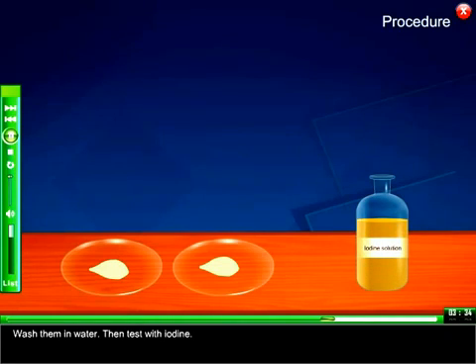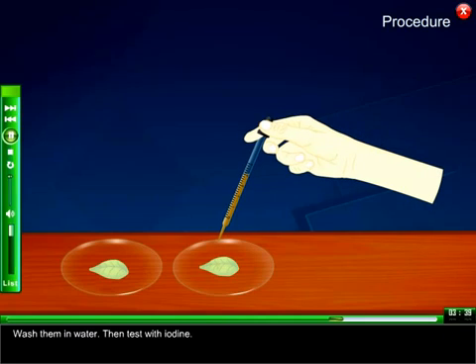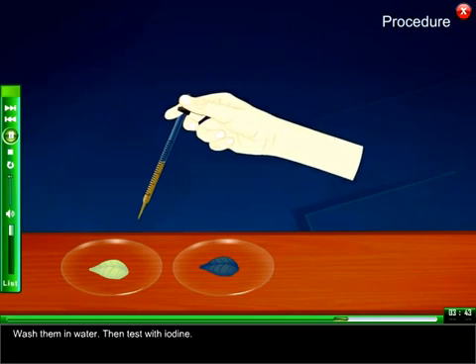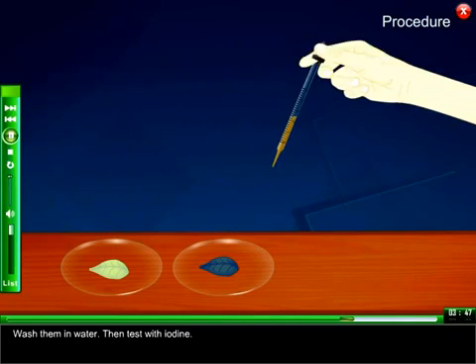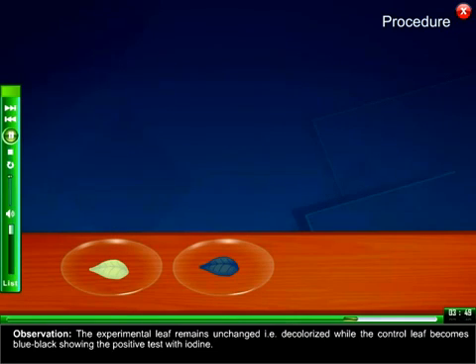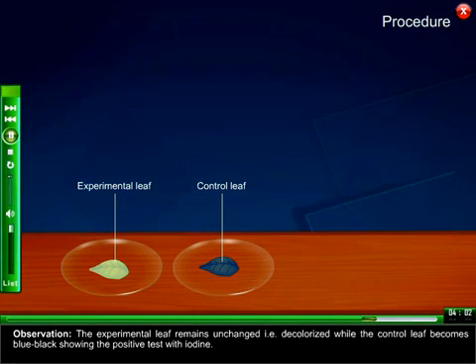Then test with iodine. The experimental leaf remains unchanged, i.e., decolorized, while the control leaf becomes blue-black, showing a positive test with iodine.